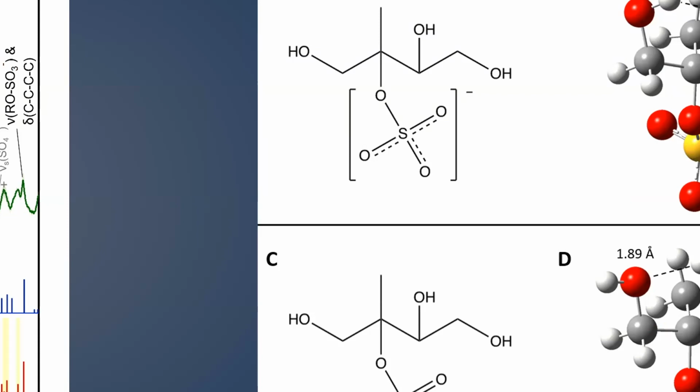So we did density functional theory. You can see here on the right side the optimized structures that we got for the organosulfates, both when it is in a deprotonated or anionic form here, as well as what's in a protonated and neutral form. And actually the pKa is a really interesting question I don't have time to talk about today, but that we've been exploring. What we were able to do is collect Raman spectra, as well as calculate where the Raman peaks should be for both the protonated and unprotonated forms based on that density functional theory and vibrational mode analysis. But what about the IR?